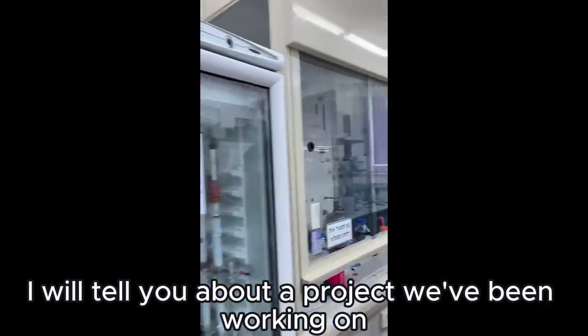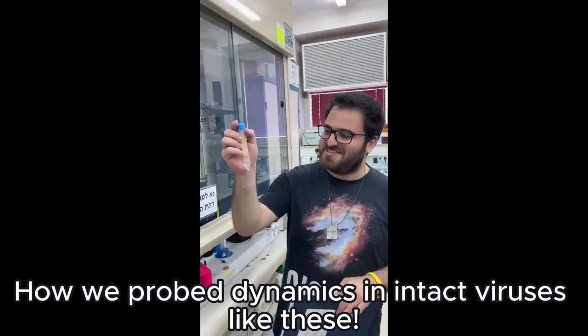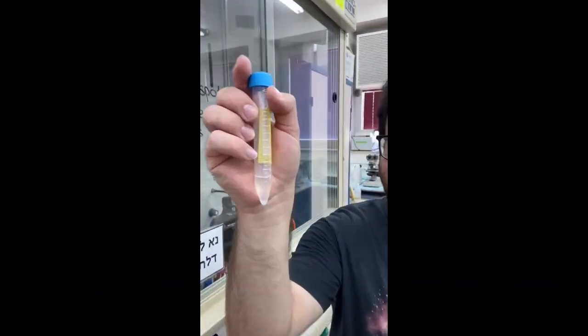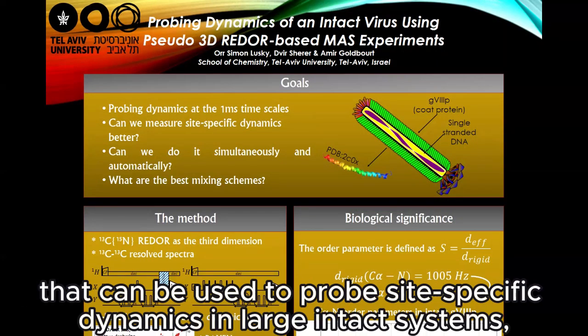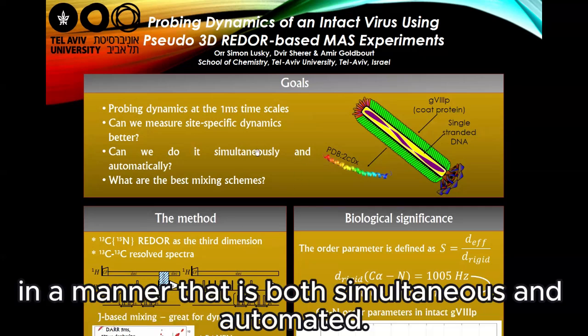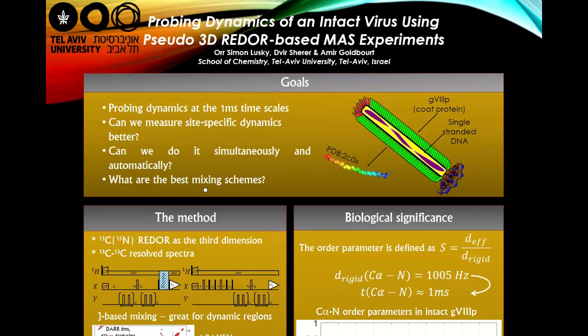I will tell you about a project we've been working on, how we probe dynamics in intact viruses like these. Our goal in this research was to establish a protocol that can be used to probe site-specific dynamics in large intact systems in a manner that is both simultaneous and automated. And we chose to demonstrate it on the intact fd bacteriophage major coat protein as a model system.